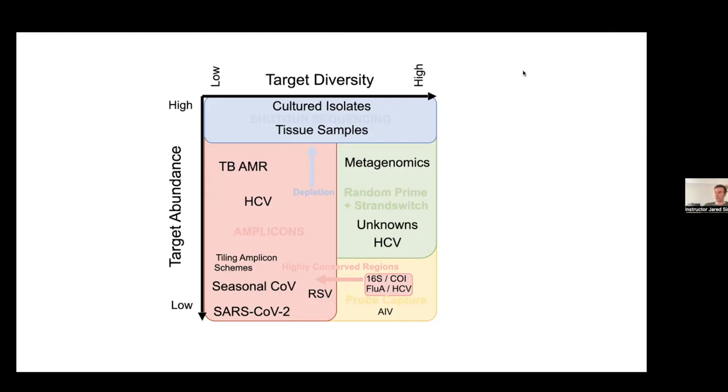For the second question about extraction techniques, it is quite important for clinical work. And we saw a lot of variation in your ability to recover complete genomes from sequencing coronavirus, depending on the extraction kit that you use.